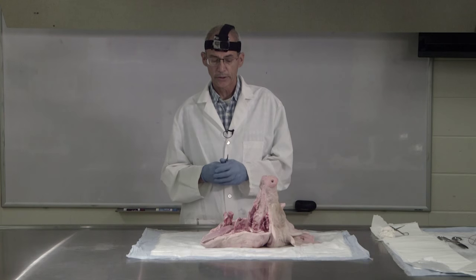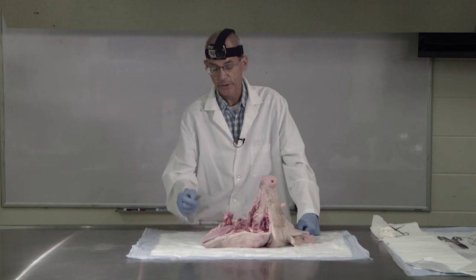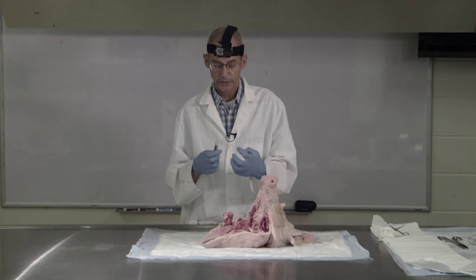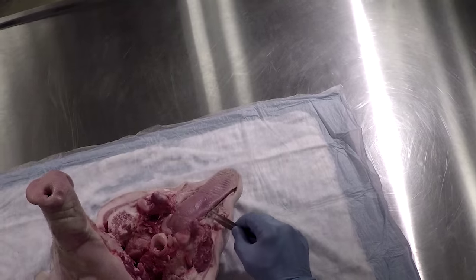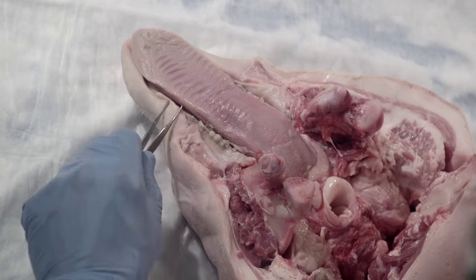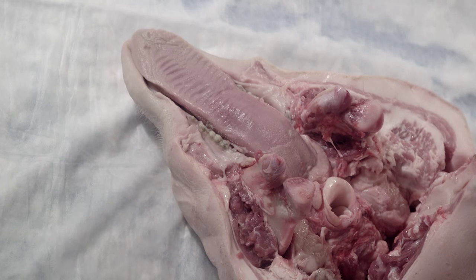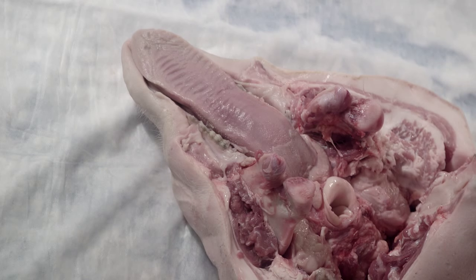That's a quick look at teeth. The next function that occurs in the mouth is actual digestion, accomplished in two ways. First is mechanical digestion — physically breaking down food into smaller pieces — done primarily by the cheek teeth, which are the premolars and molars collectively. There is also some mixing activity as another form of mechanical digestion. The tongue manipulates particles, moves them around in the mouth, facilitates chewing, and helps distribute saliva.